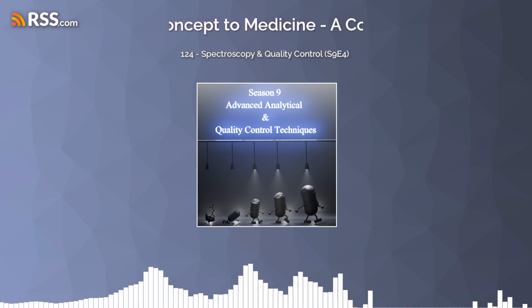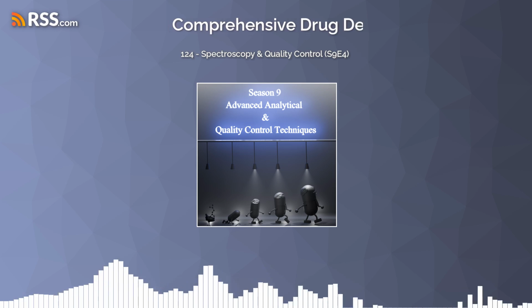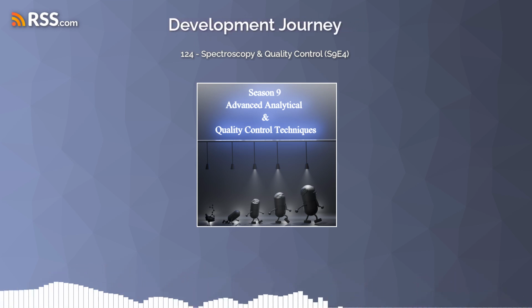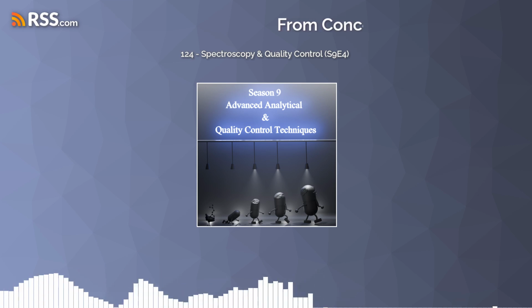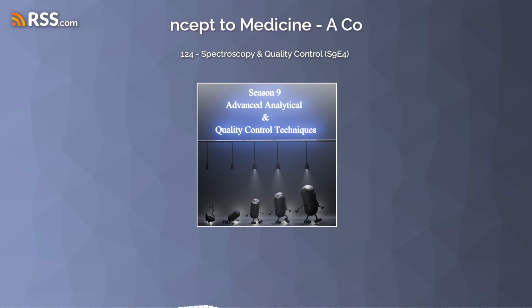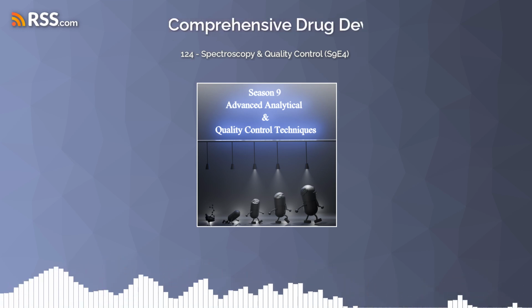Some parts of the mixture have too much drug and some parts don't have enough. Exactly. So the system can actually trigger an alarm, tell the operators to stop and adjust the process. And that prevents a batch of tablets from being produced that don't meet the specifications. So again, it's kind of like a real-time quality check that prevents problems. It ensures that every tablet has the right amount of drug in it.